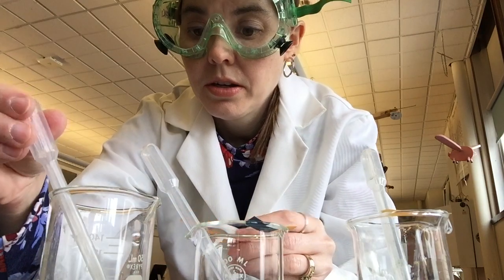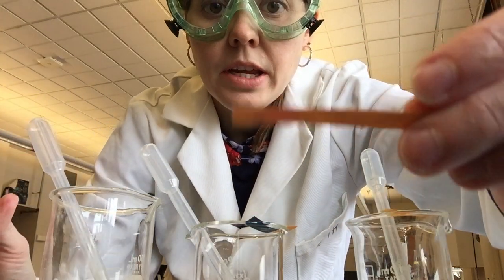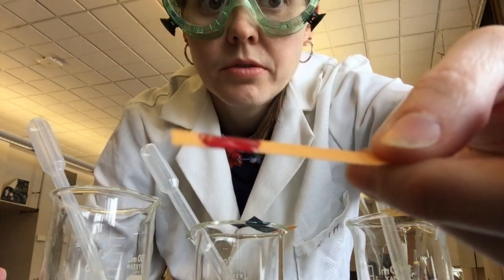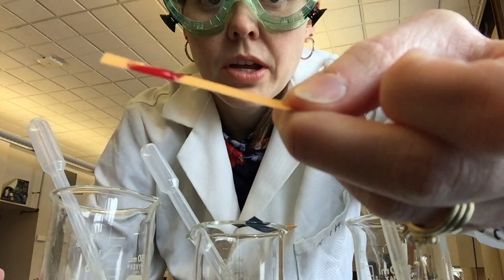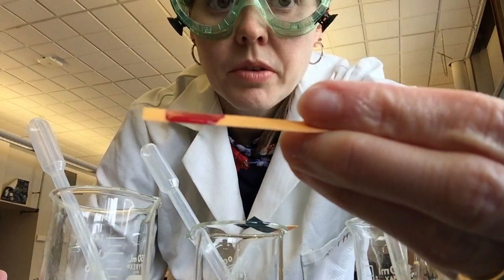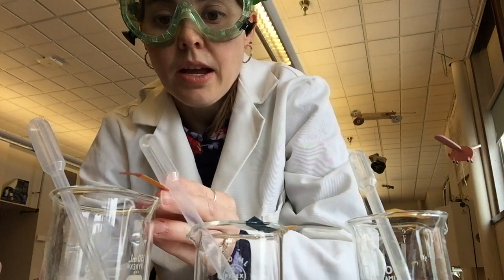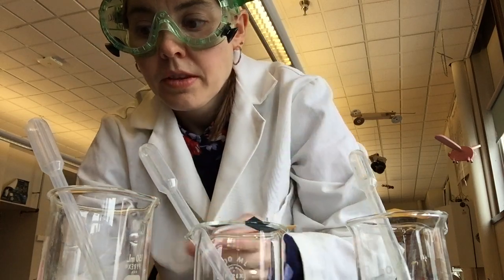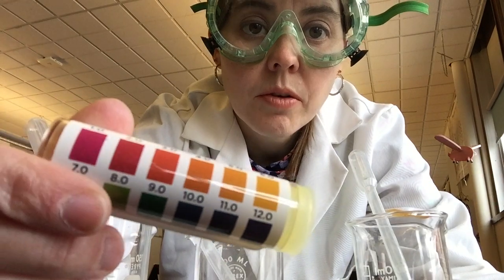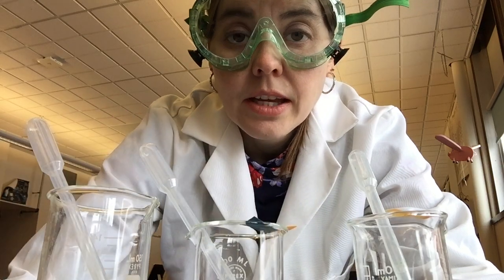My last one turned a bright red — you can see there, a nice bright red color. Bright red means acidic. On my scale, red is around 1 or 2, so this one is very acidic. That last beaker was actually sulfuric acid.